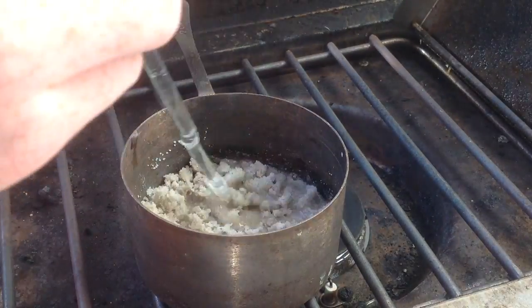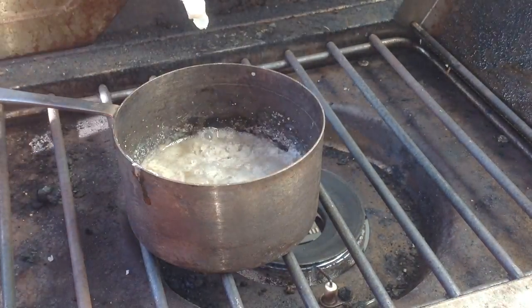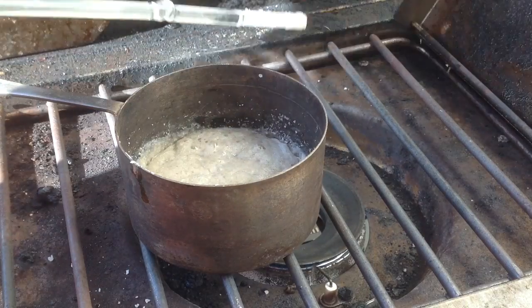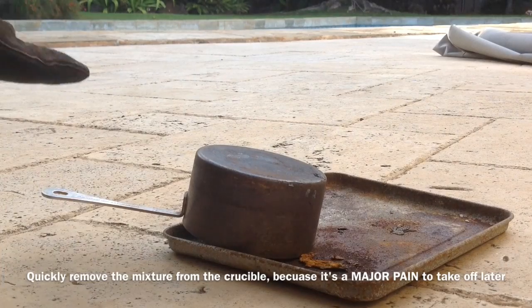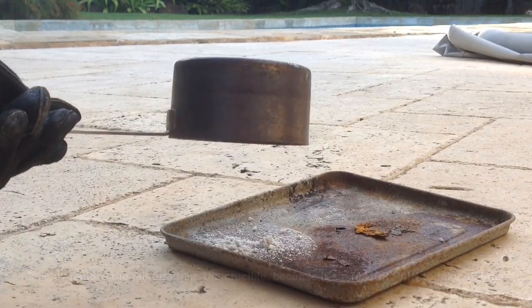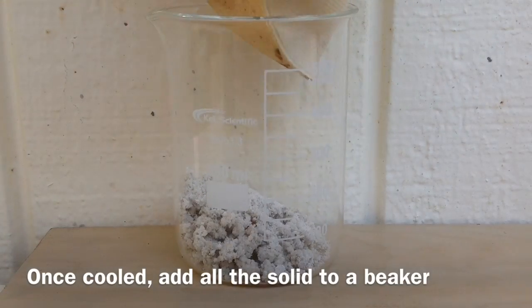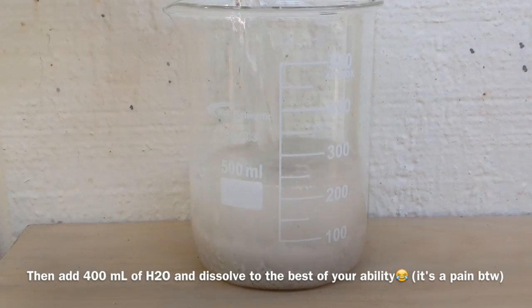Here it is after some heating — the sand may look like it hasn't dissolved yet, but eventually it all will. Once it's almost stiffened up and the water is gone, you want to get it out quickly because it hardens like glass — I had to use a hammer. We then transfer all the sodium silicate and excess sodium hydroxide to a beaker and dissolve it in about 400 milliliters of water.